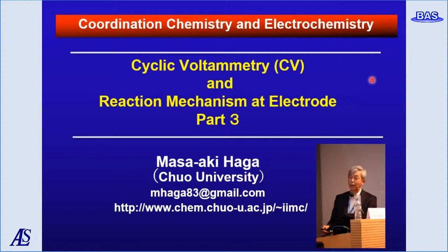Good afternoon. This is Masa-aki Haga of these lectures. This is the fourth lecture on cyclic voltammetry and electrochemical reaction mechanism at the electrode. Continuing on the previous three lectures, today I deal with the proton-coupled electron transfer mechanism. Then I will introduce a new steady-state voltammetry technique, which is the rotating disk electrode.